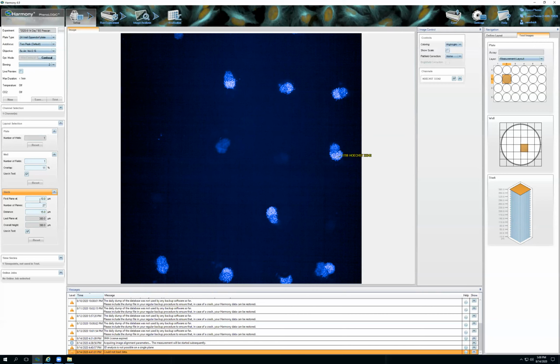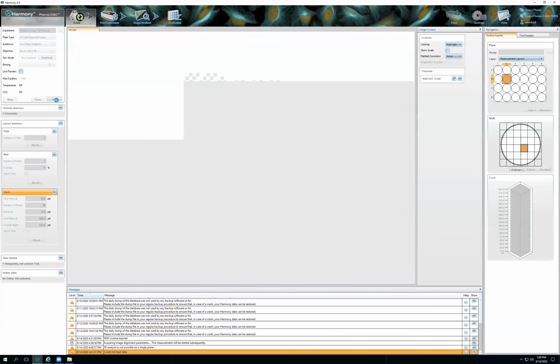So I'm going to come back over here on the left to my Z-stack, and I'm going to say, okay, I want to make sure I'm getting all of them. So let's go to 500 microns, and I'm just going to try that, hit test again. Again, go back to test image, select on this, and go to the bottom of my Z-stack.